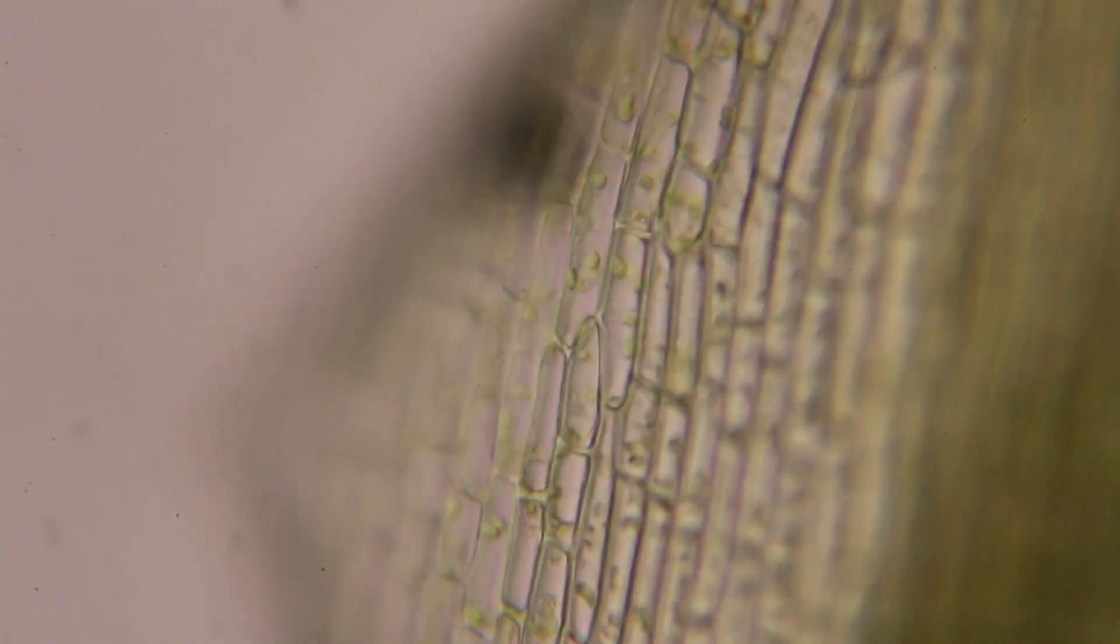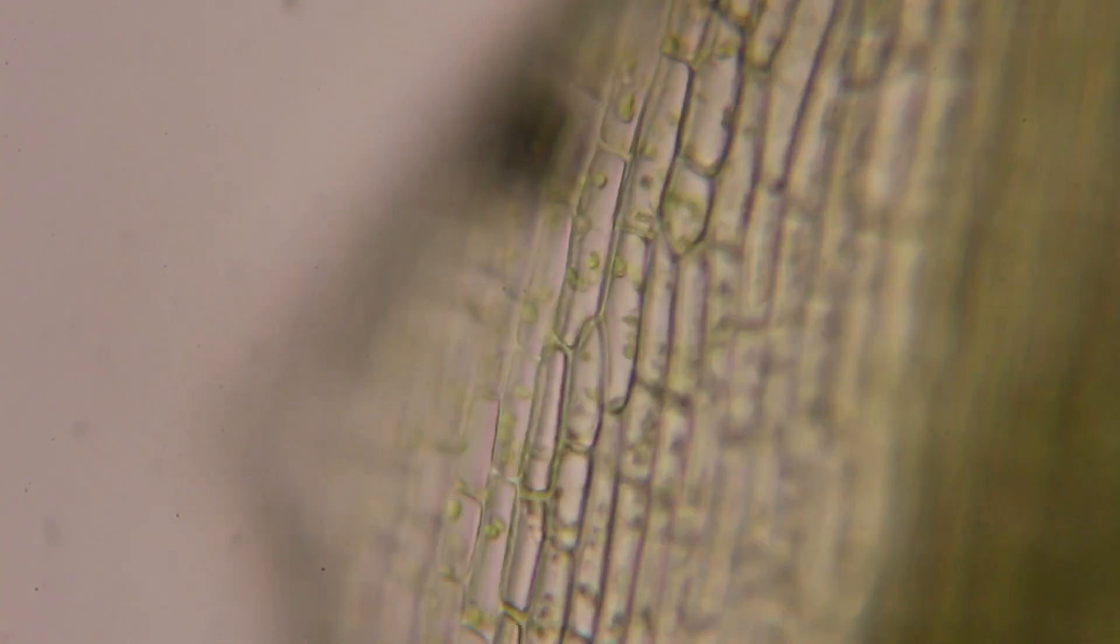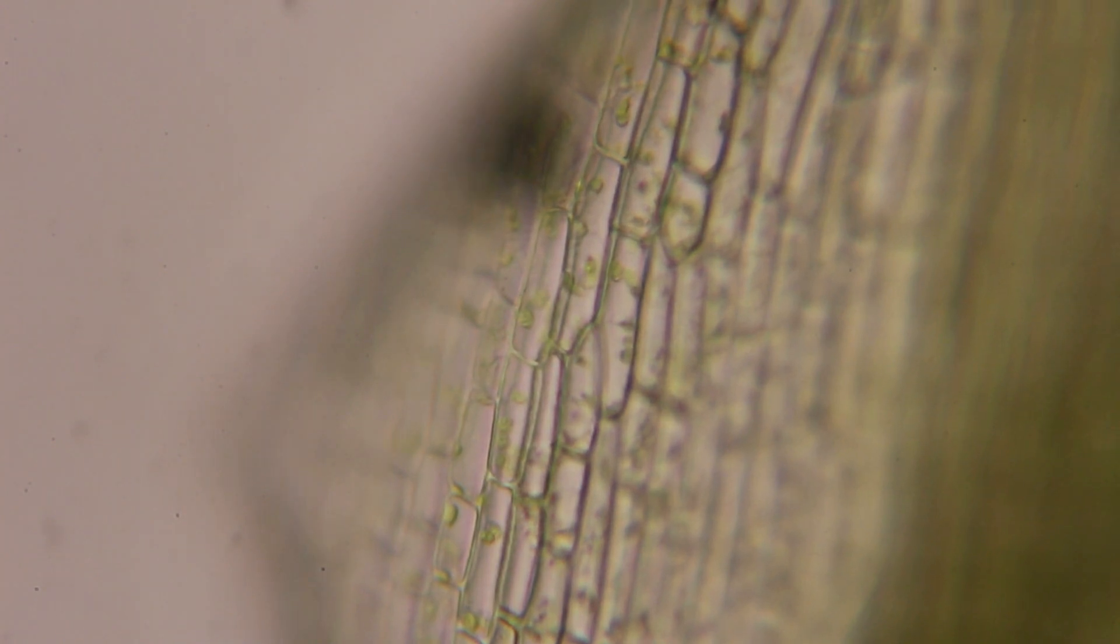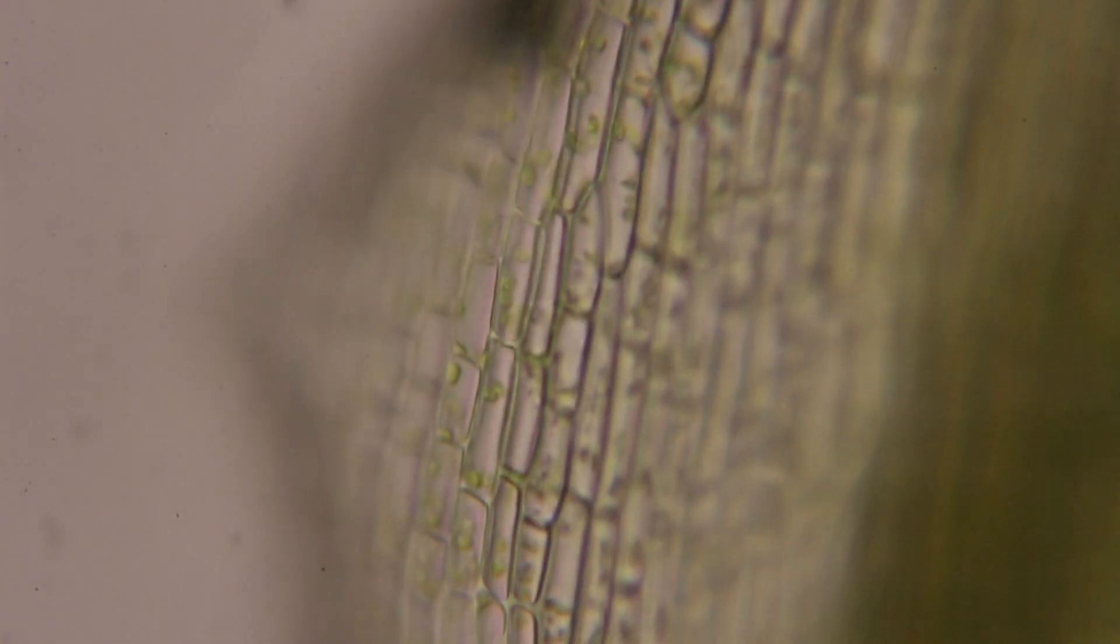Then the next one is 800 power. You can get a really good view of the chlorophyll in the chloroplasts. And it's really neat how you can see the green chloroplasts in there. And there you can see there's some places where it's dark because the light can't get all the way through.